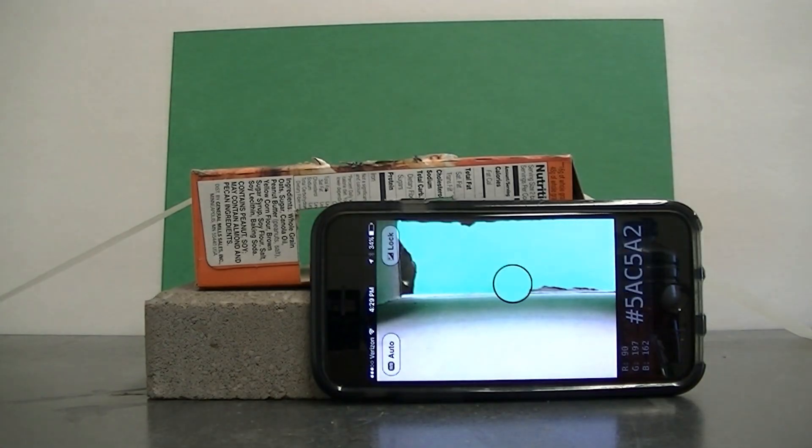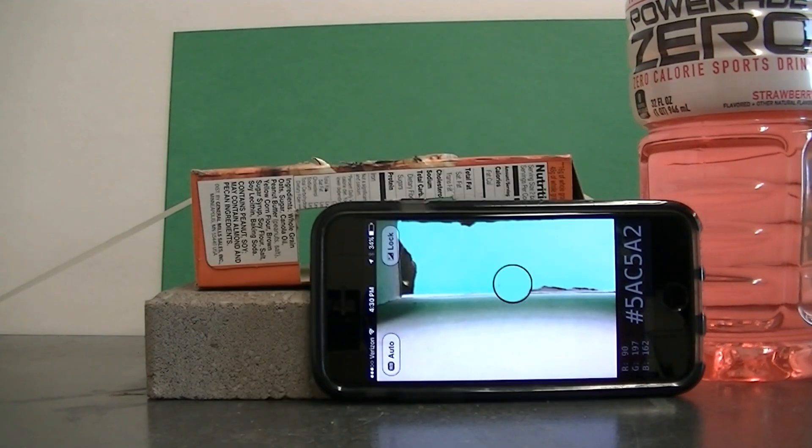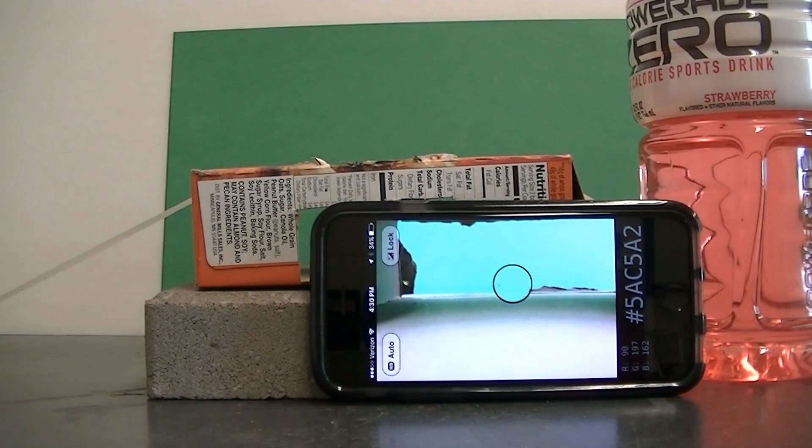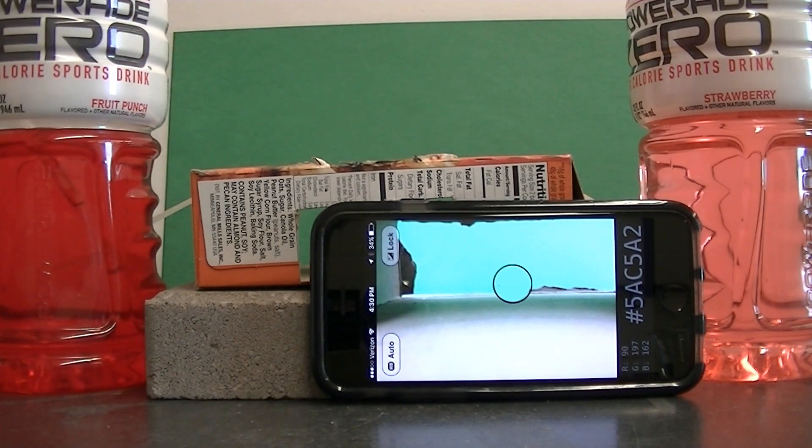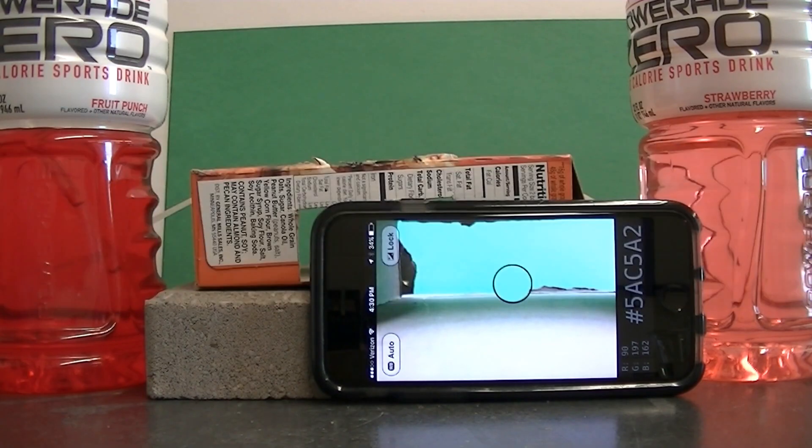Now what we'll do is we're going to go ahead and use this to try to figure out how much red food dye number 40, also known as allura red. I've measured the concentration of red dye number 40 in fruit punch Powerade Zero and I found that to be 94 micromolar or 94 times 10 to the negative 6 molar red dye number 40 in this fruit punch Powerade Zero. And I've just diluted it to various extents to make my standard solutions.